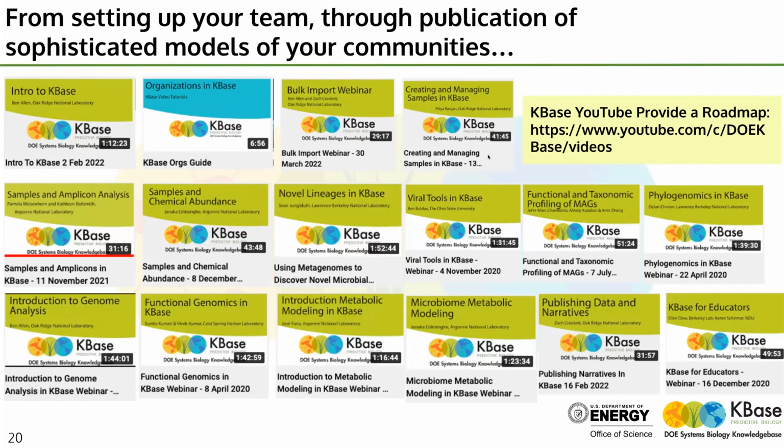What's really game-changing, aside from being able to do this all in a single place, in a shared environment where you can collaborate on it, is that once you're done, it is easy to publish these results out into the world with a single click. You can get a DOI number, and you can get something that is available and searchable by Google, and is a fully reusable FAIR representation. It means a findable, accessible, interoperable, reusable representation of all the work you've done that is citable.